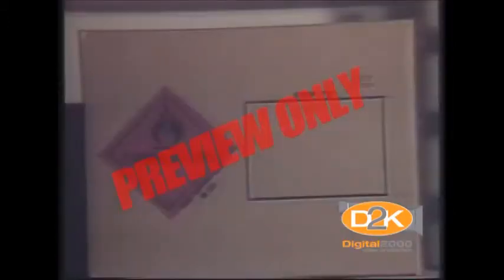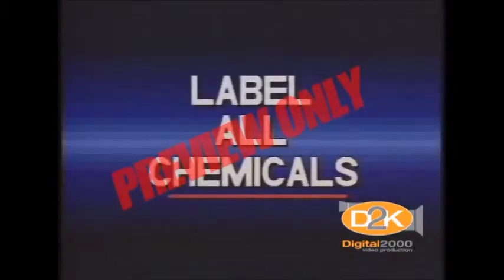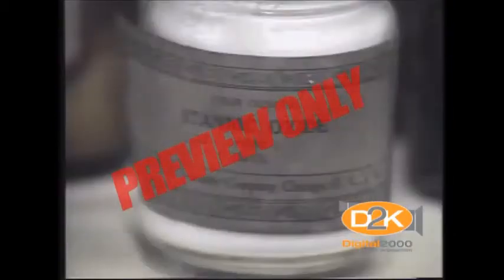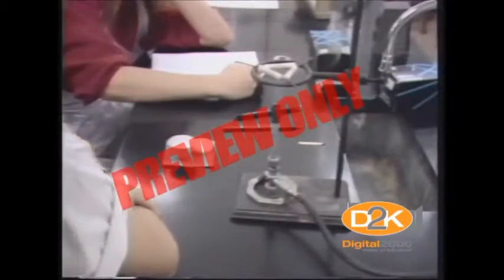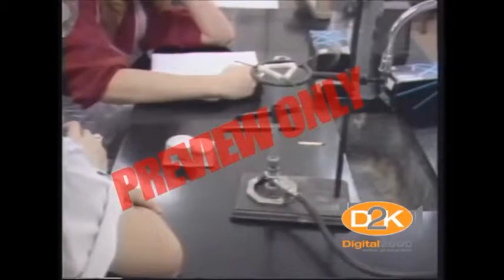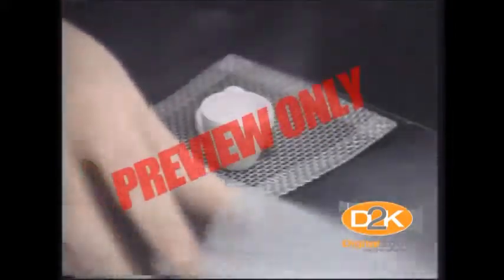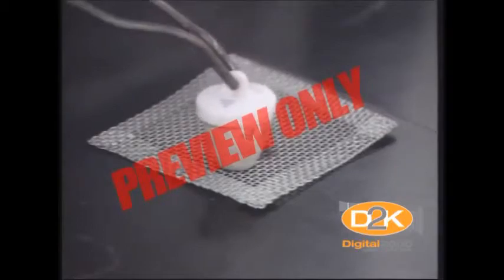We didn't talk about chemical storage or labeling requirements, but you should always label all chemicals. It's too easy to get them mixed up, and there are many chemicals that react differently with other chemicals. The more work you complete in labs, the more you'll learn about safety and how to reduce both the physical and health hazards of the substances used in experiments. Begin now to develop a healthy respect for chemicals and hazardous materials.